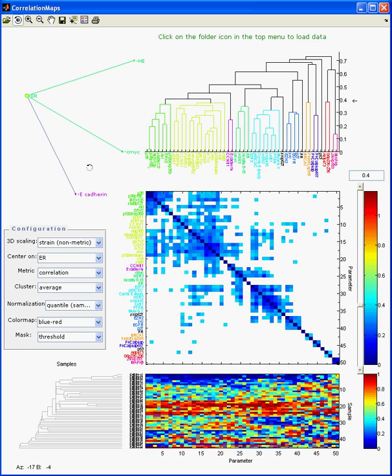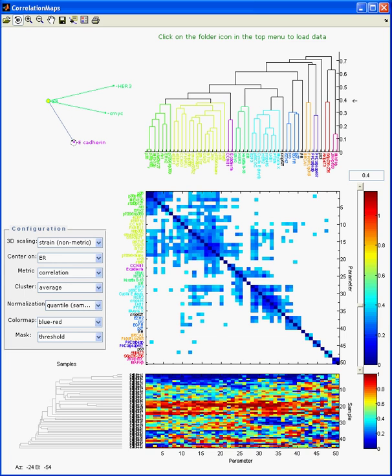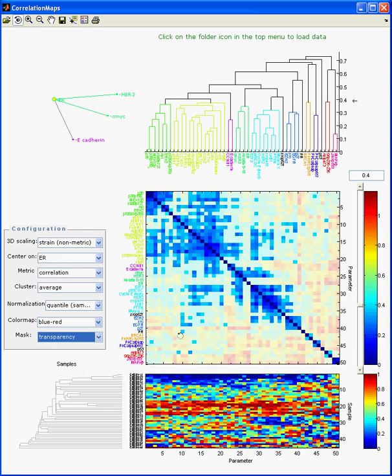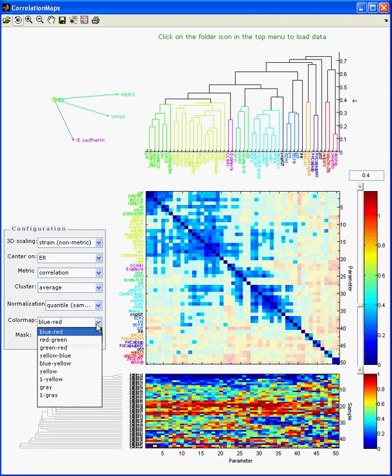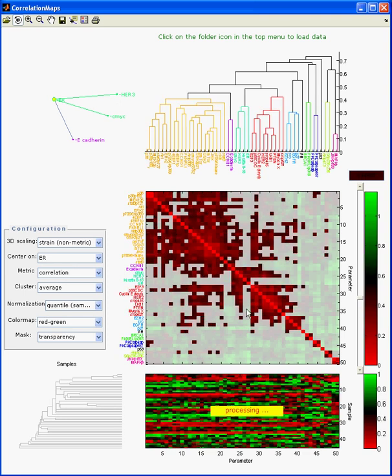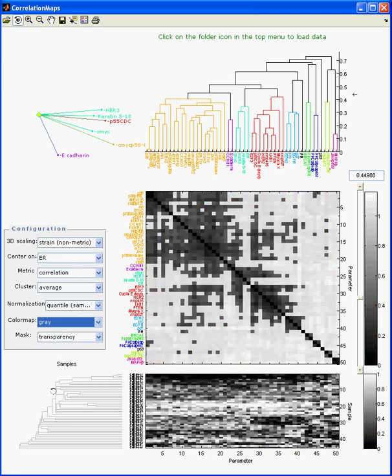There are a number of tools that allow you to explore this further, including rotating the representation. Instead of having this hard cutoff point, you could have some sort of transparency tool to highlight the background or represent it with a fainter color scheme. There are lots of graphic tools that we can push into the user's desktop to provide a richer interaction with the data set. You can also play with the color scheme — red-green — and whatever you do here it gets reflected immediately. You could also do grayscales and so on.